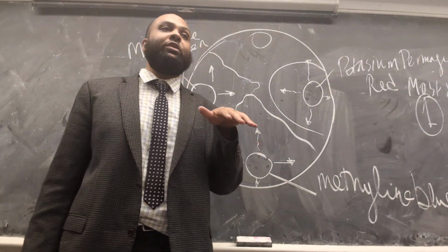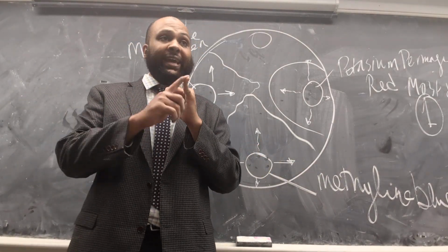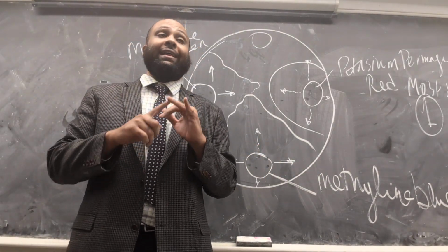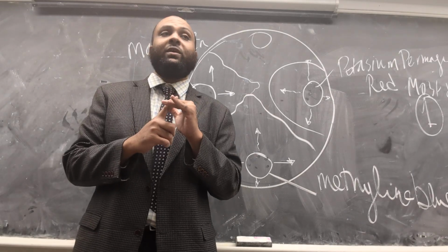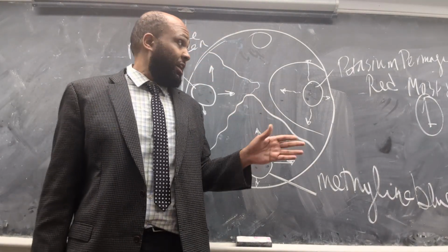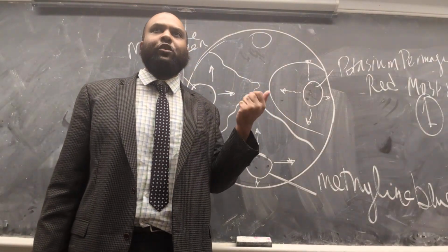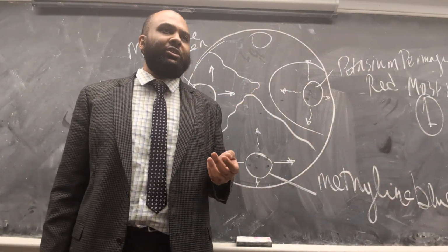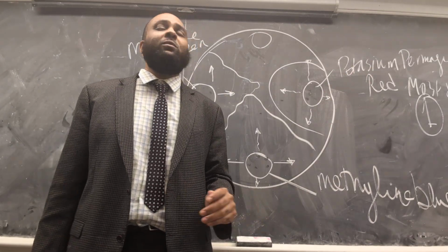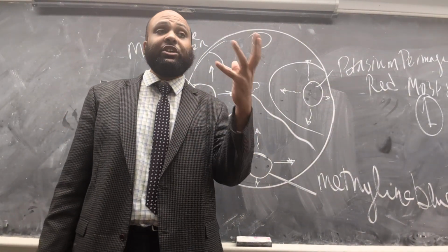So now we're just talking about who gets to the other side first. The weight is going to play a role. The heat, how hot things are, is going to play a role. The pore, the medium we're passing through. If you replace this agar gel, this solid gel, with a water solution, they'll be all over the place in no time. So this is just teaching you the factors.